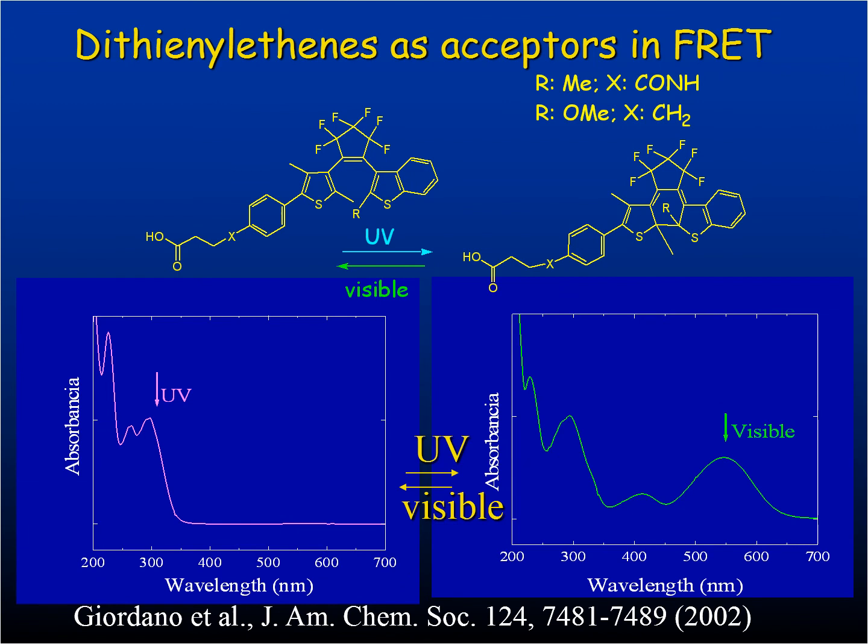Here you see an example of a molecule that has the ability to reversibly change upon UV radiation from one form into another form, and with visible light it basically converts back into the original form. And both forms have a different spectrum, as you see here by the absorbance spectrum, but of course they also have a different fluorescence emission spectrum.